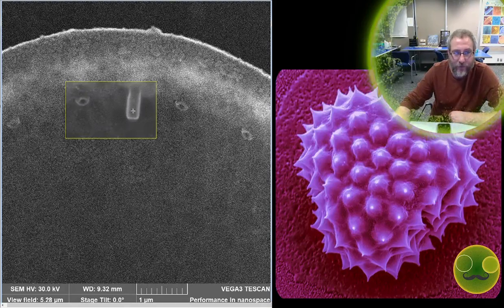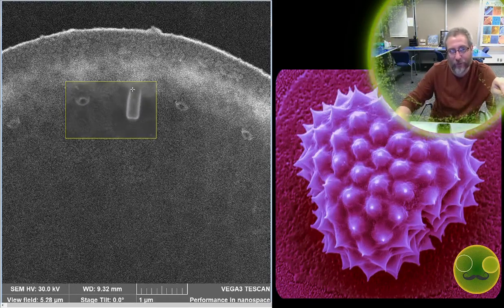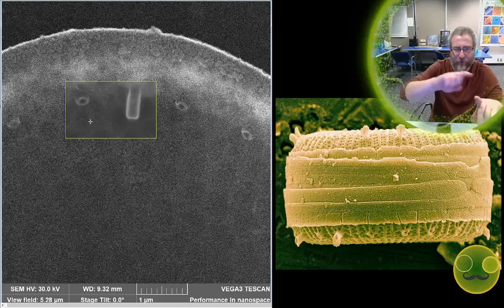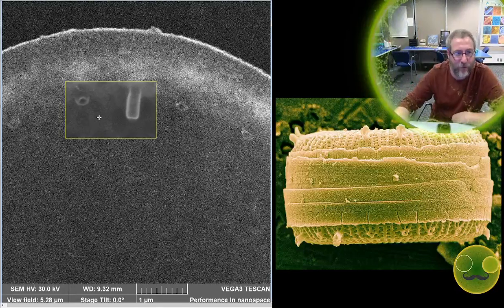And then this thing is the labiate process, which is another useful component of the genus Thalassiosira. It basically looks like a little mouth, and this one's kind of sideways and you can't see it very clearly, but there's a slit that runs down the middle of this piece of silica here. And then it has sort of the shape of a fan, almost like a fan you might fan yourself with.